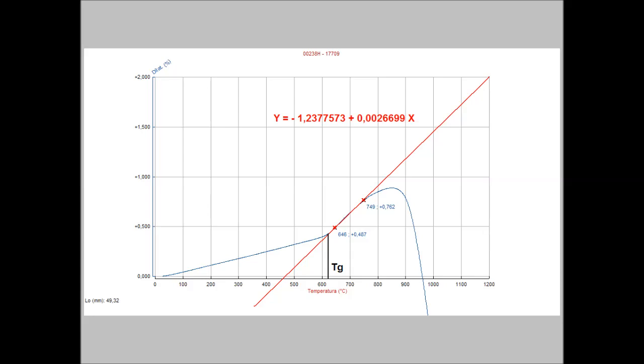This instrument is carrying out the measurement with no contact and it is not deforming the sample. The part of the curve above the transition temperature, TG, and before the softening can be several hundred degrees wide.